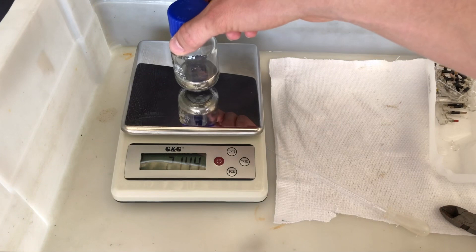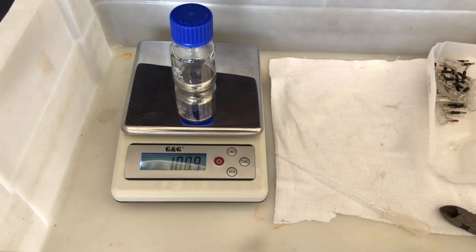In the end the bottle was weighed again. It weighed approximately 109 grams, which means that one switch contains about 10.9 grams of mercury.